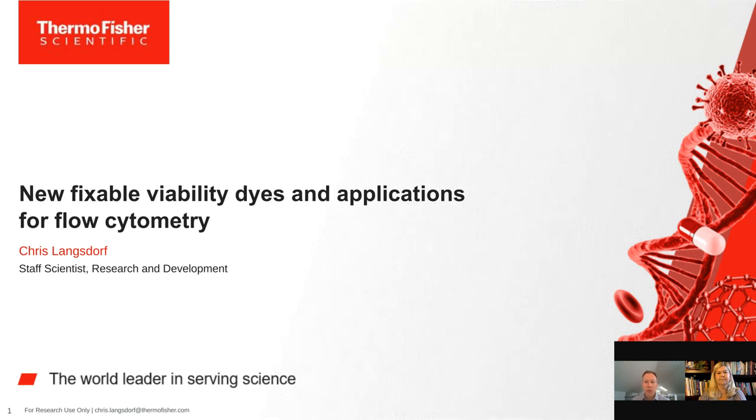with NovaFluor antibody conjugates. And so I have a lot of experience in the lab using various colors of the live-dead fixable viability dyes in combination with panels using the NovaFluor antibody conjugates. And they make a good match together when you're pursuing larger, either conventional or especially spectral cytometry panels. So yeah, thanks for mentioning that.